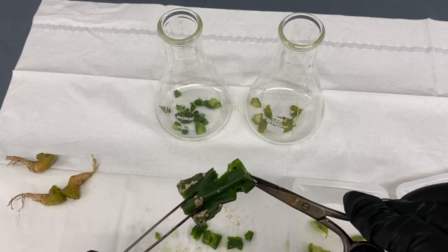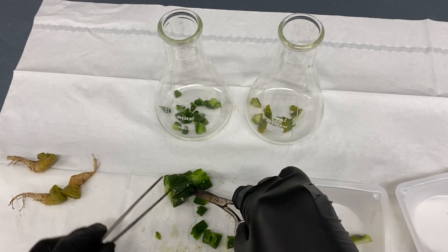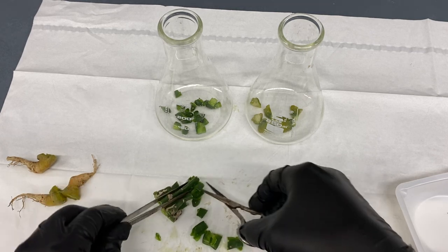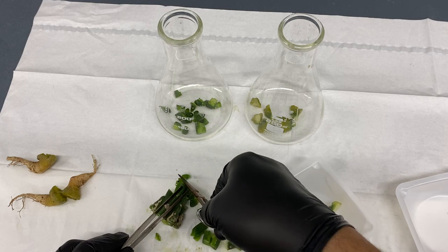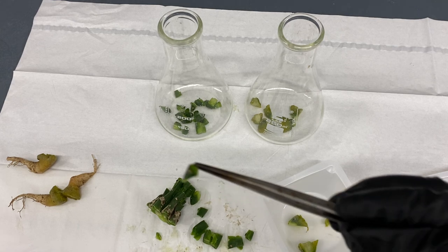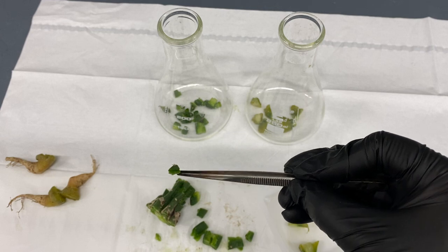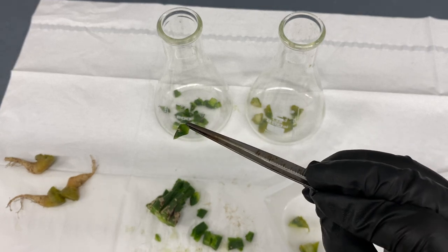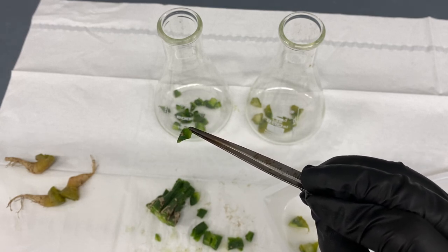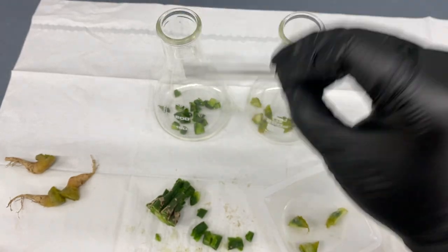What we're doing is cutting all of the nodes — all of the growth points. On a cactus, that's anywhere there is a spike. If I find tissue with spines coming out, that's a node. What's in that flask is just a tiny piece of tissue with a spike on it. We're leaving a little bit of extra tissue for the bleaching process because it's going to kill it off a little bit, which helps leave some companion cells to promote growth.